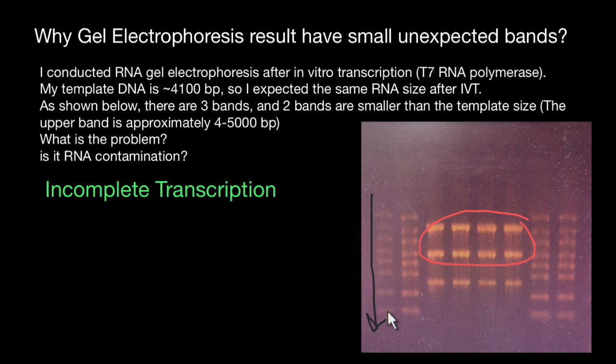Premature termination can happen due to various factors such as template secondary structure, incomplete removal of inhibitors, or suboptimal reaction conditions. You can try optimizing the reaction conditions, including adjusting the concentrations of nucleotides, enzymes, template, and incubation time.